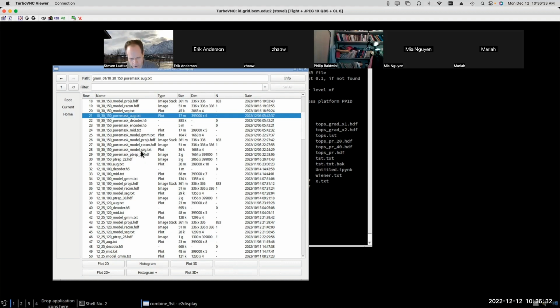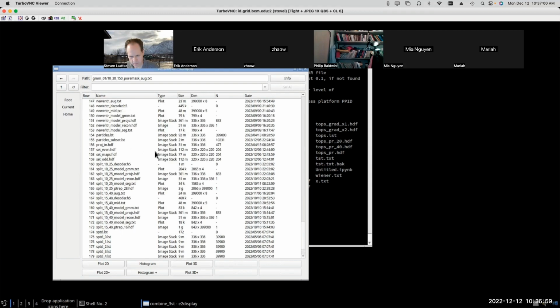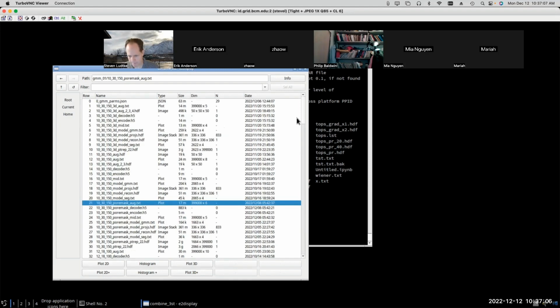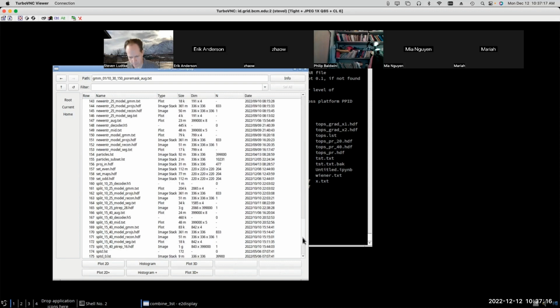Anyway, the thing you were asking about, which is the reconstructions. So the reconstructions aren't specific to a particular run of the GMM. If we look down here, we will find projections, set even, split, particle subset. So I'm just looking for the maps. Oh, there we are. Set even, set odd, set maps.